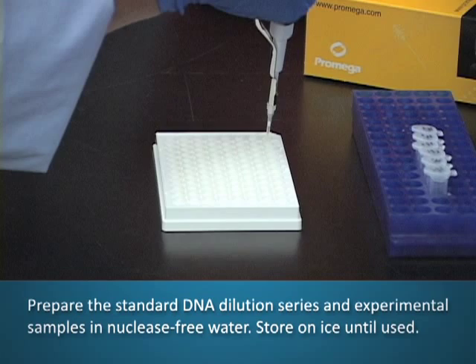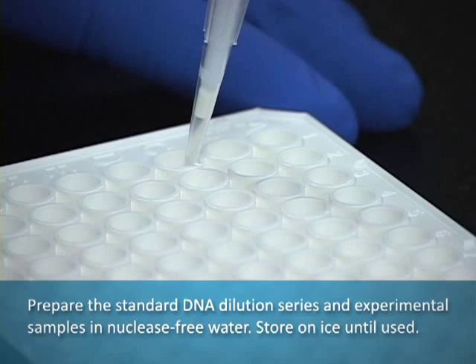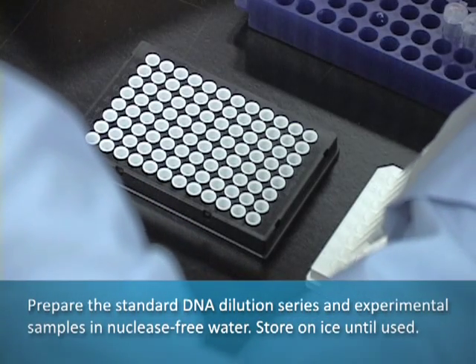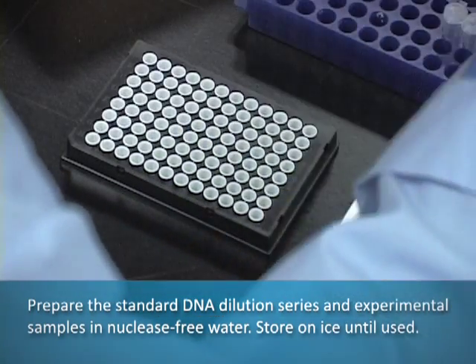Prepare the standard DNA dilution series and experimental samples in nuclease-free water. Store on ice until used.